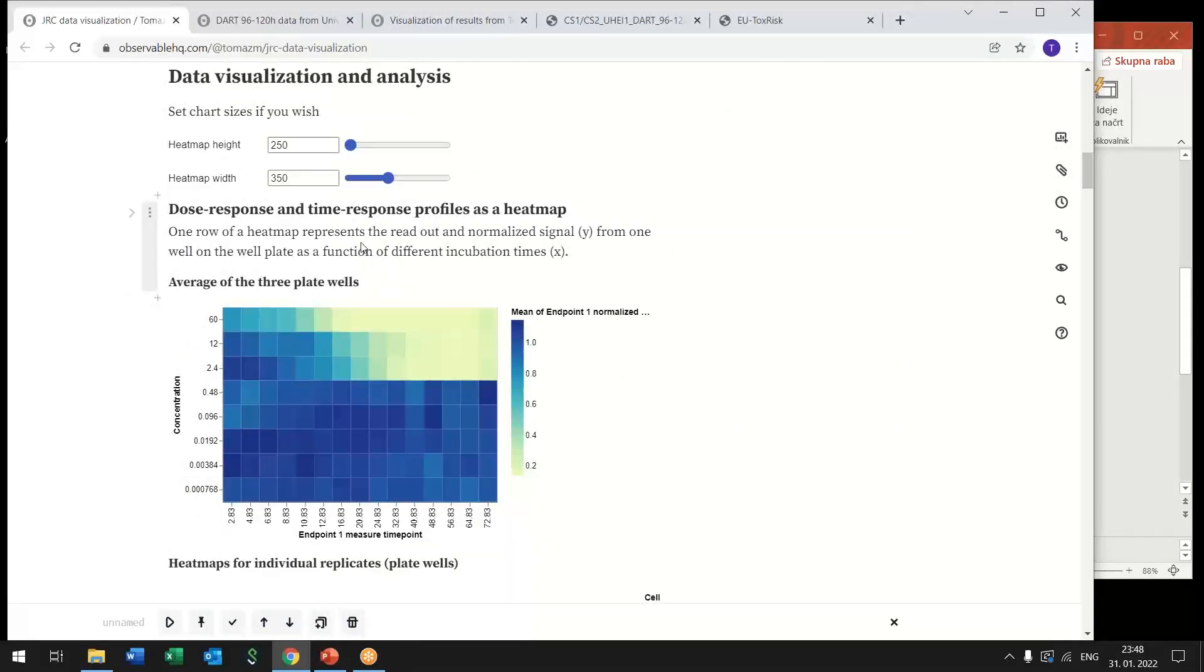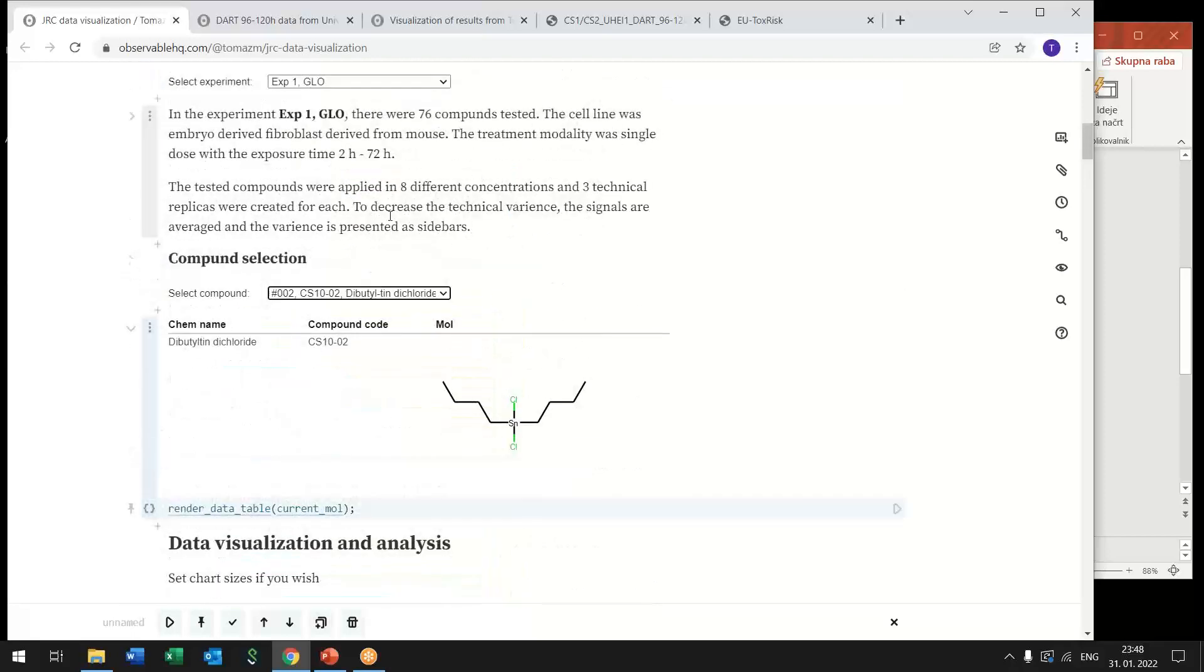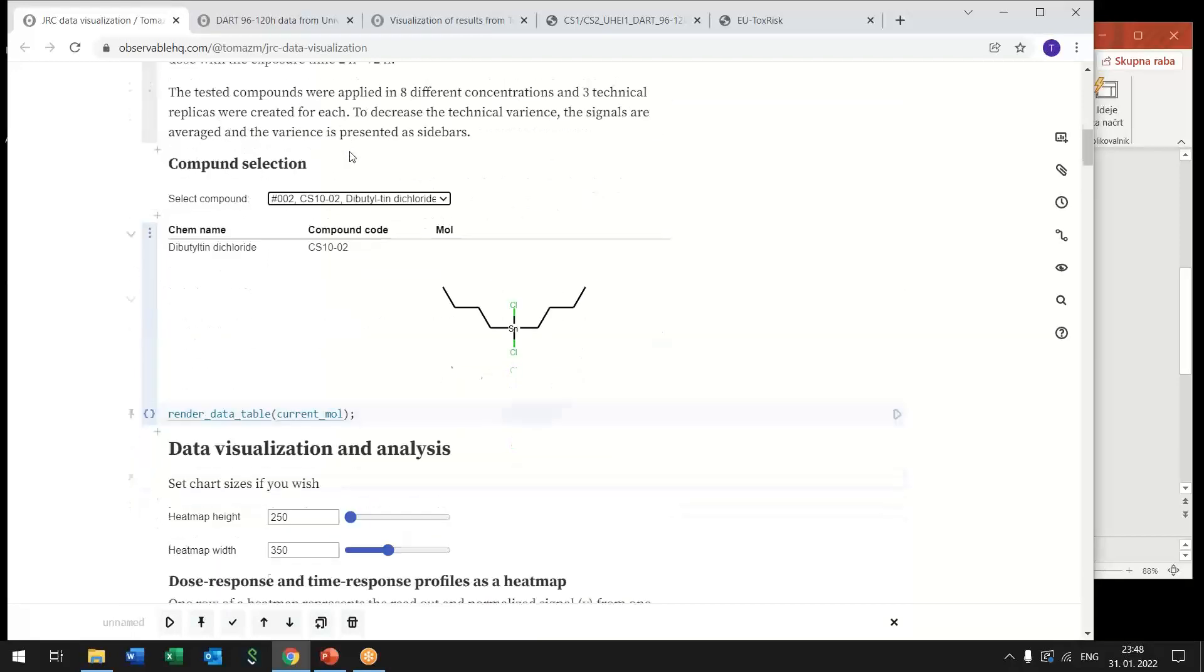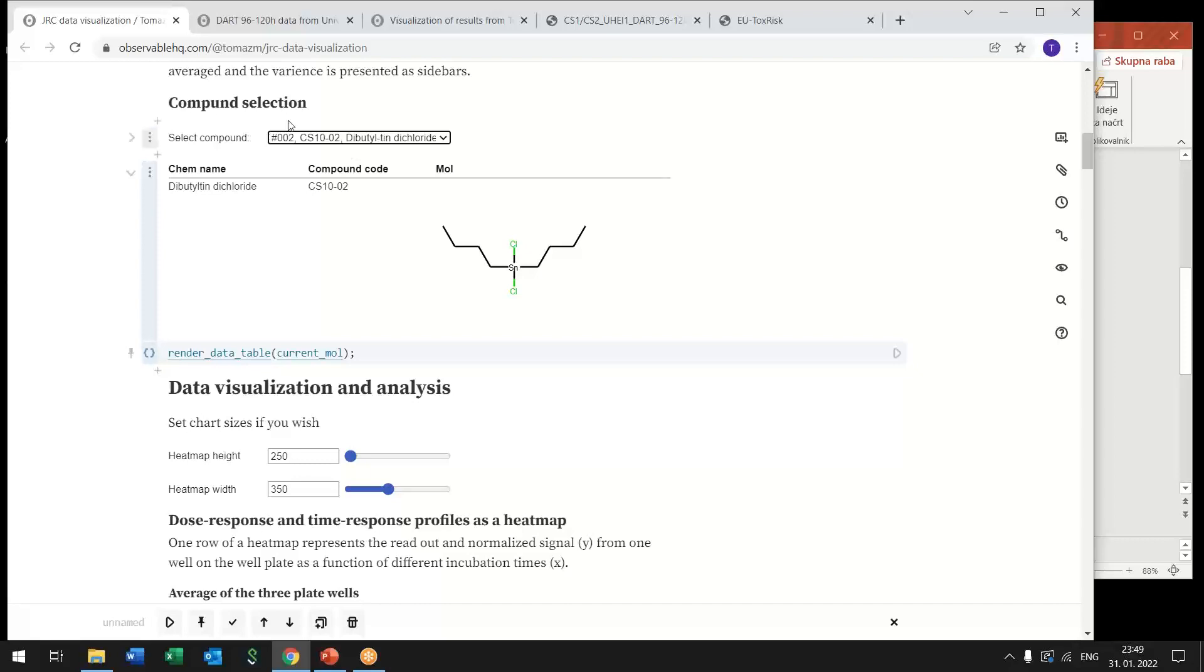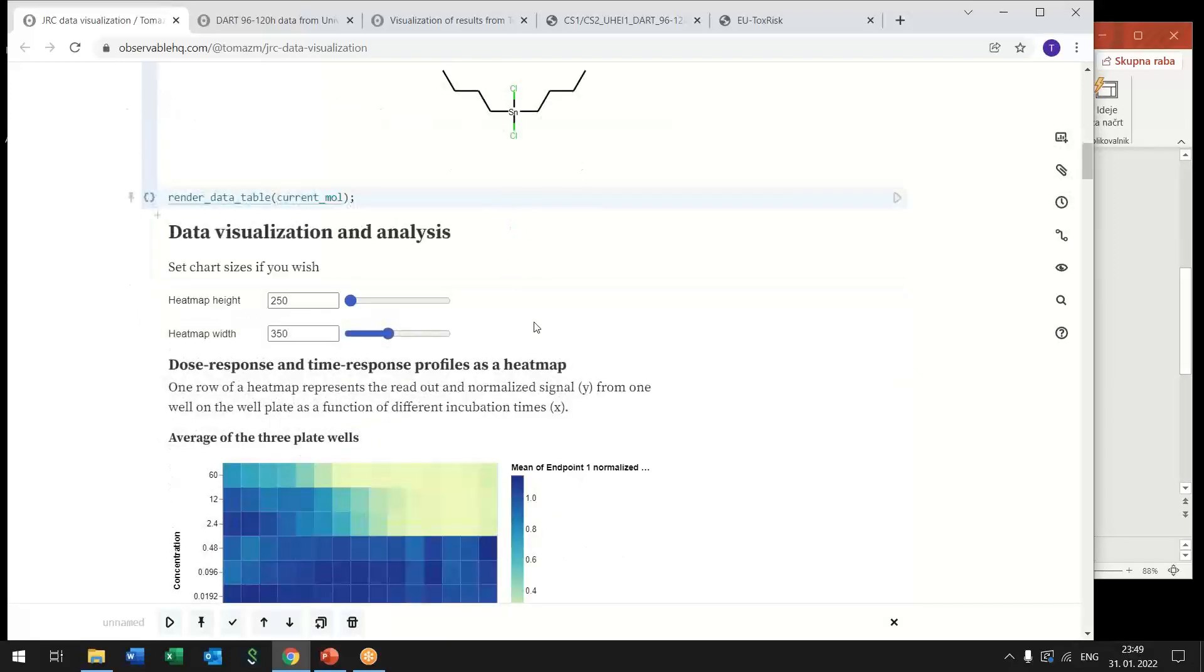And so based on this selection, based on the experiment and compound selection, the notebook accesses data in the database. So data from these assays were published on Edelweiss Data within the NewTox Risk project. And now this data is accessible from different applications and this notebook is just one example of such an application.